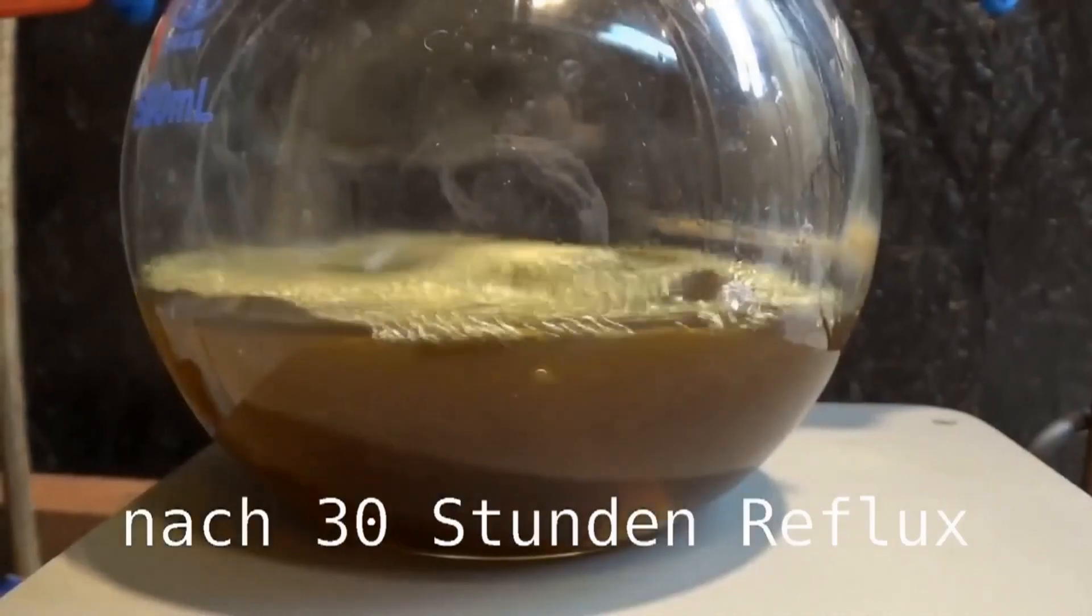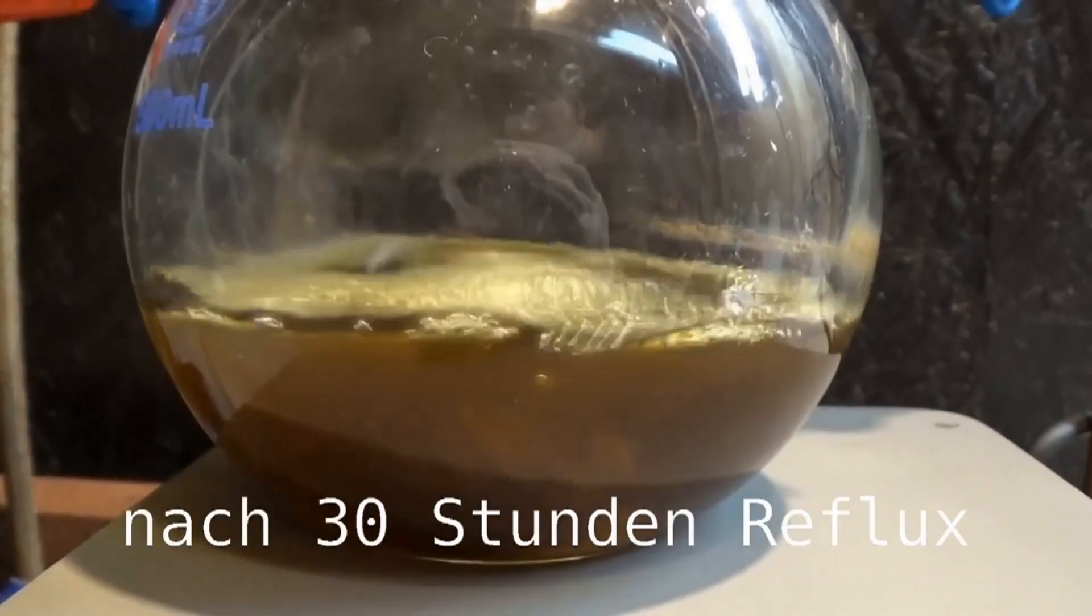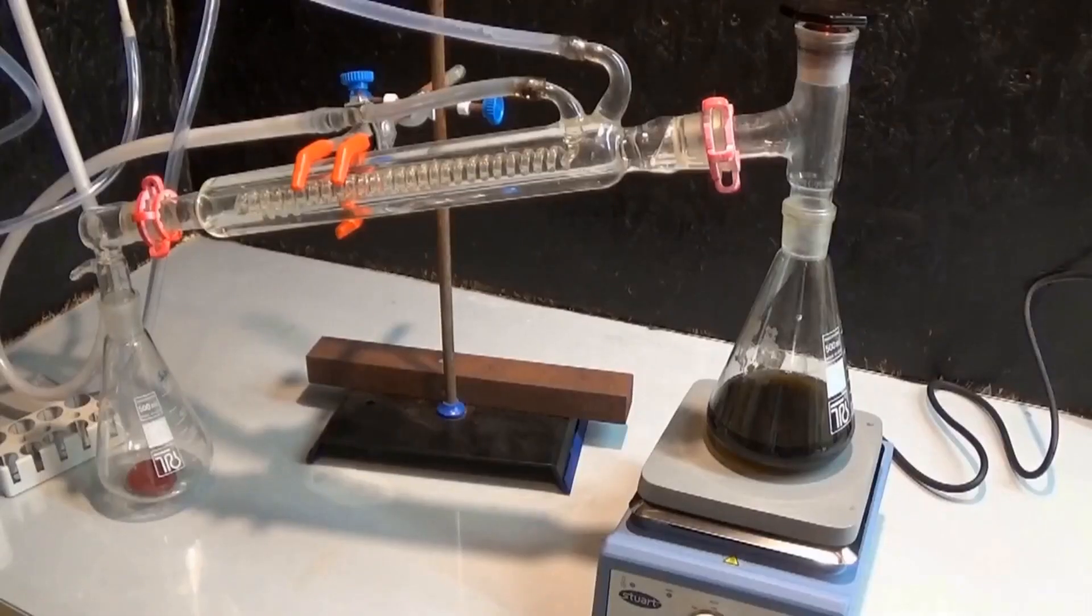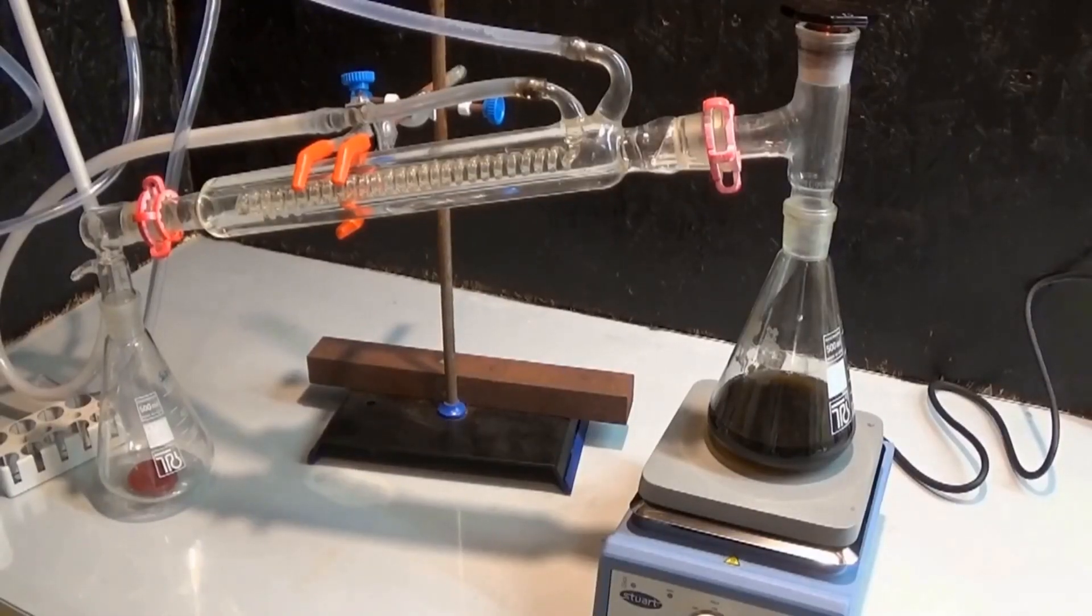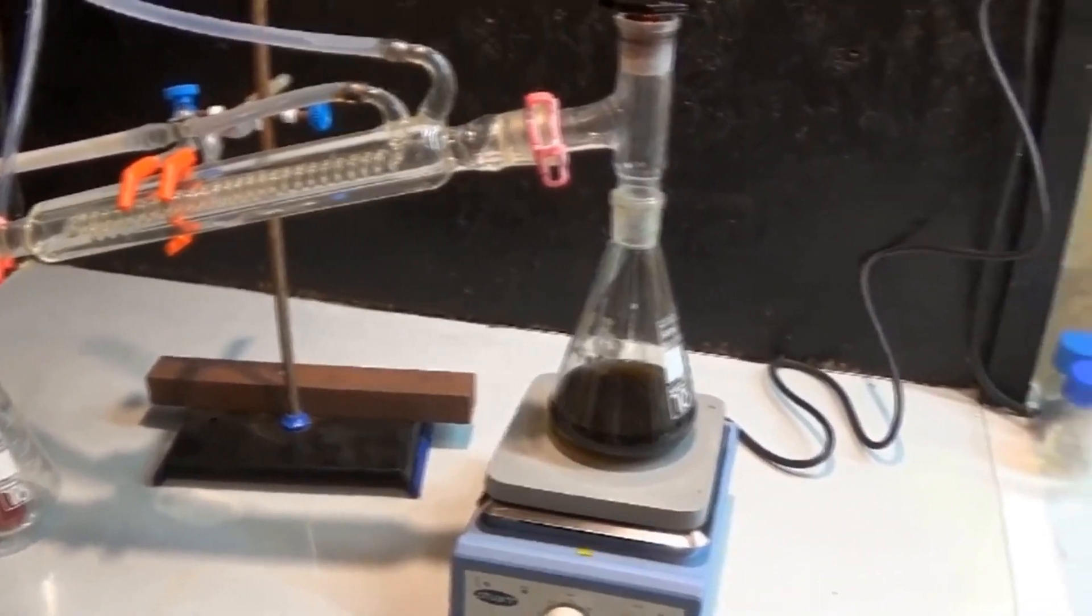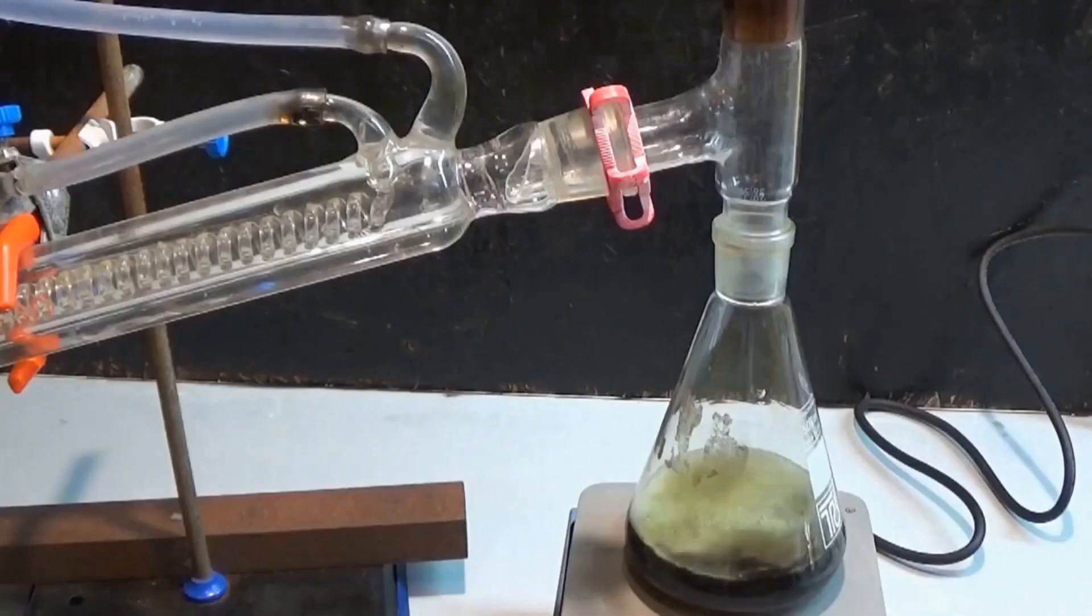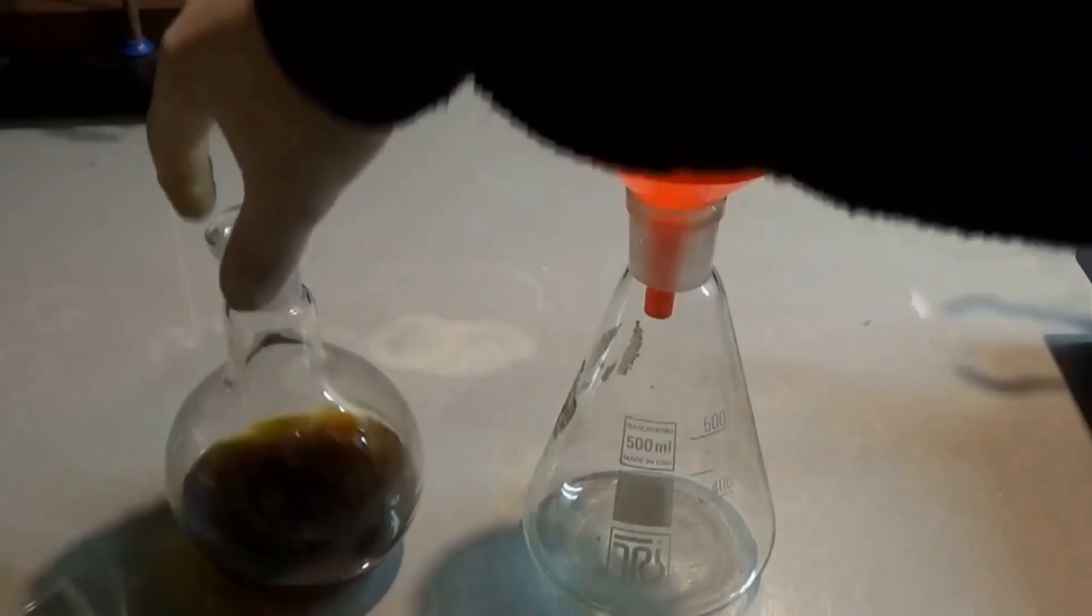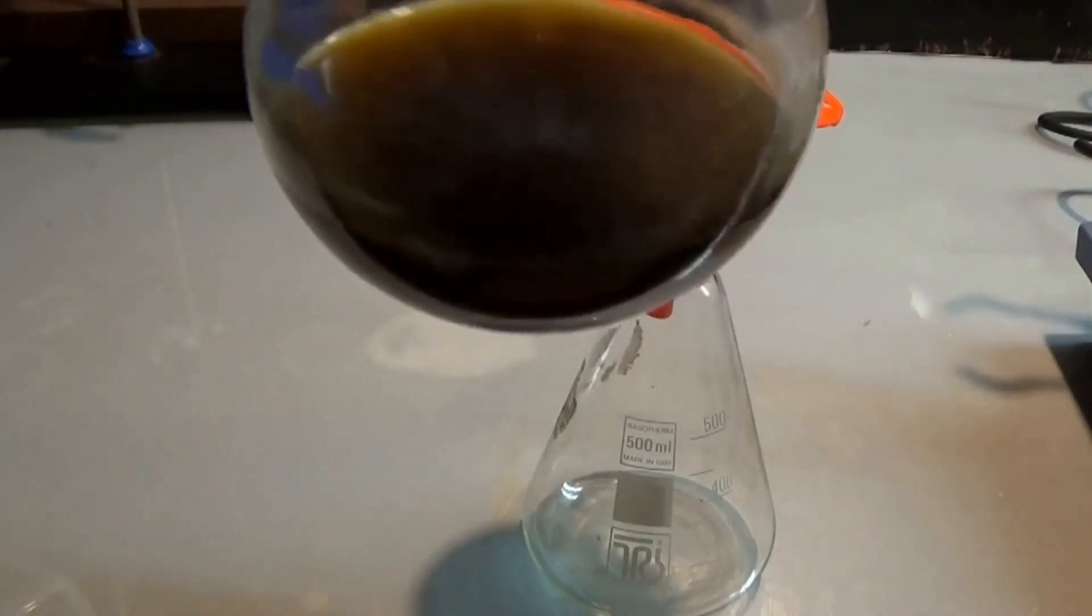Now that we have performed the extraction, it is time to clean up the extract. For this, I transferred the extract into a distillation apparatus and reduced the volume by around 50 percent. This was mainly because ethyl acetate can be hydrolyzed by sodium hydroxide, which we will use in the next step. As a fun chemistry fact, keep in mind that caustic ester hydrolysis is a non-reversible process because the organic acid lacks the proton to reform the ester with the alcohol.